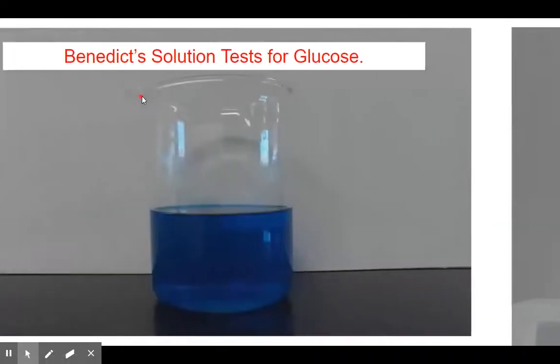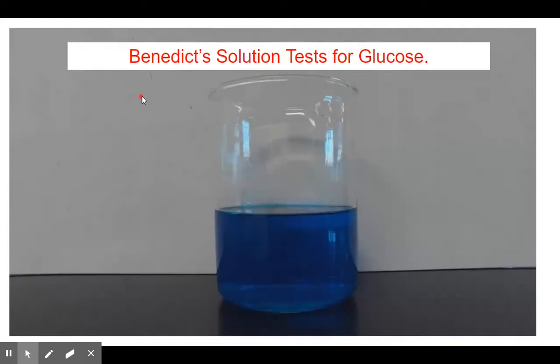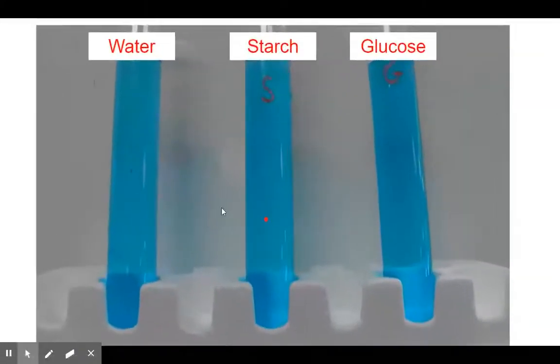The first thing we want to do is use Benedict's solution. Benedict's solution is a solution that tests for glucose when you heat it up. Right now you can see it's a blue color. In the presence of glucose, after you heat it up, and only in the presence of glucose, it's going to turn a red color. So we want to add Benedict's solution to water, starch, and glucose just to see how it works.